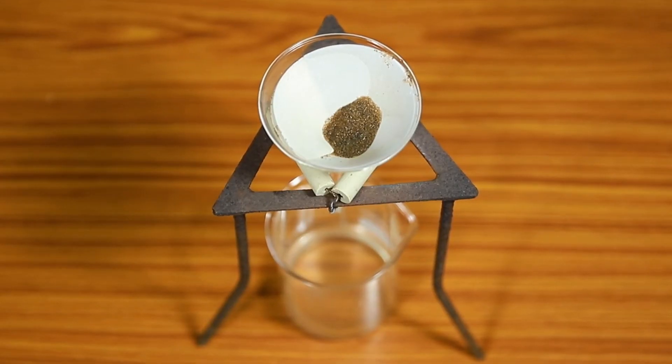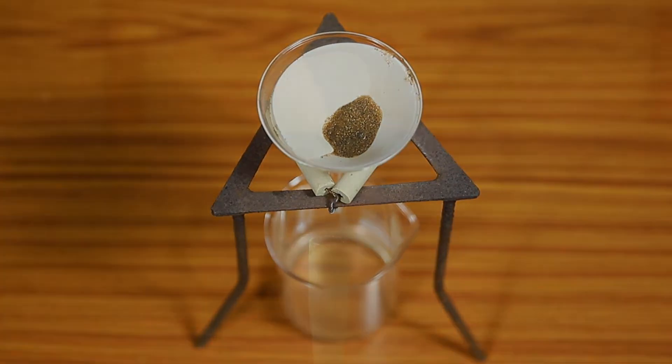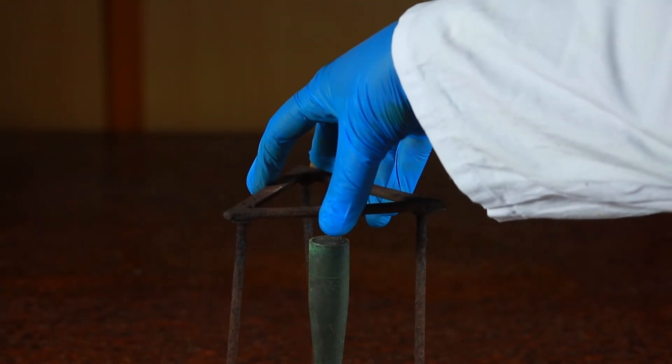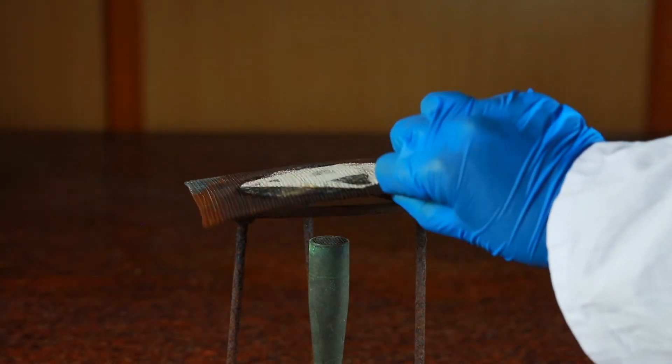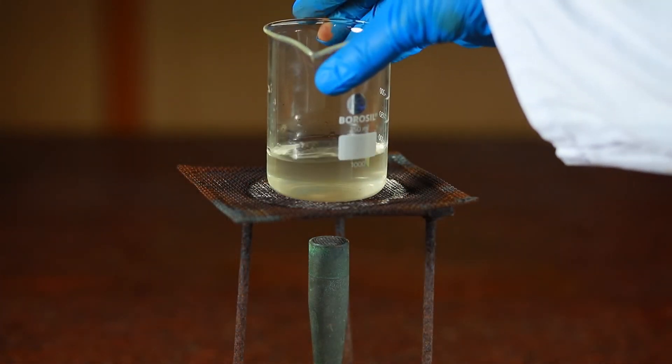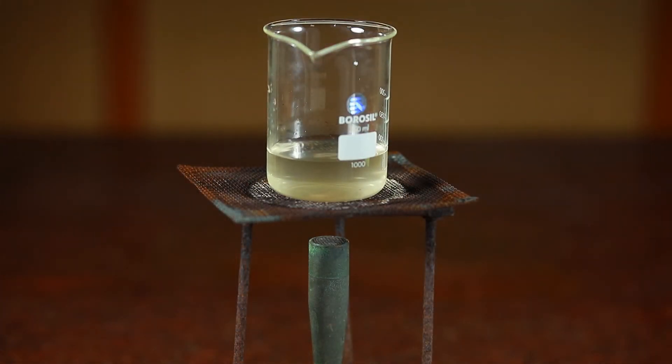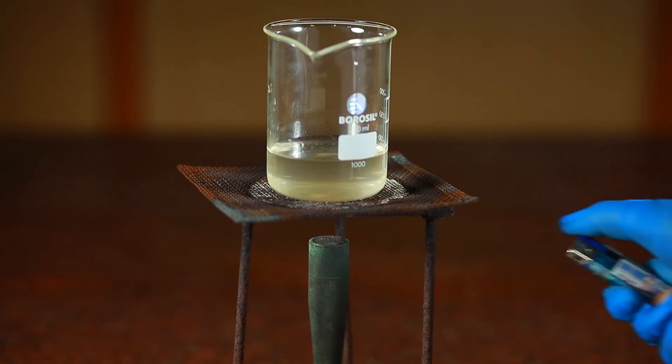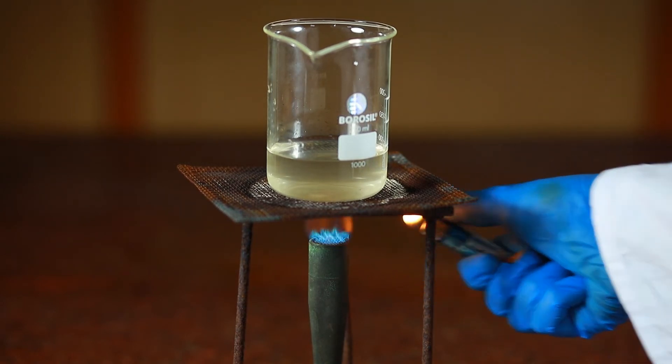Place a tripod stand on top of the burner and then place a wire gauze. Place the filtrate containing beaker on the tripod. Turn on the burner and ignite the burner using a matchbox.